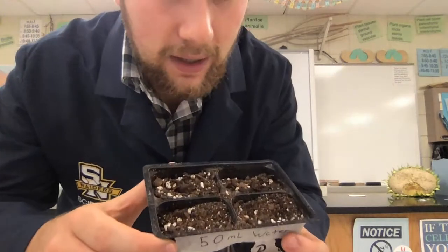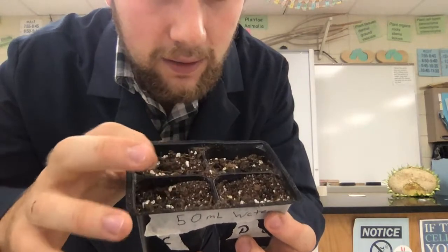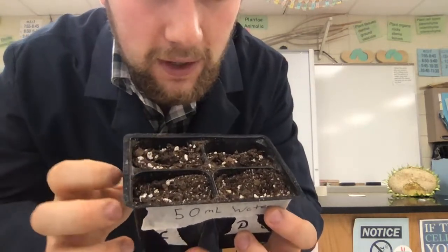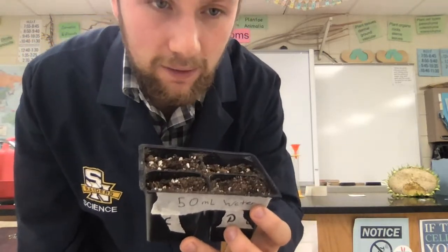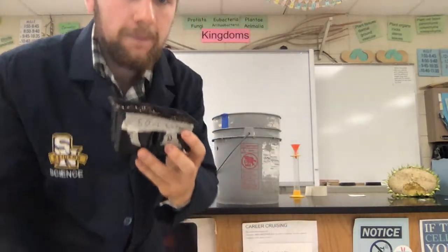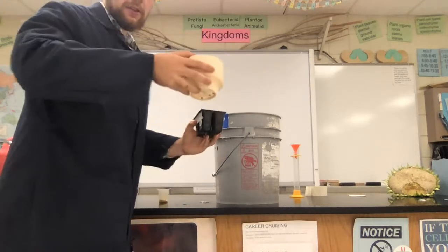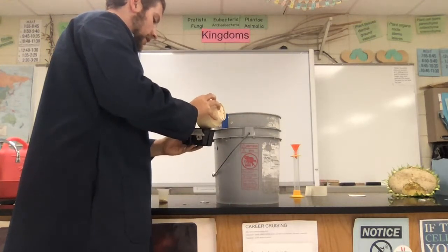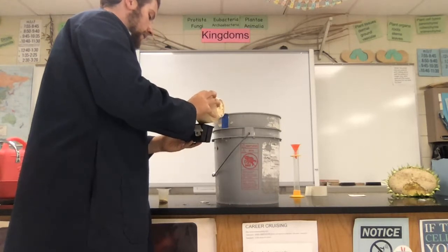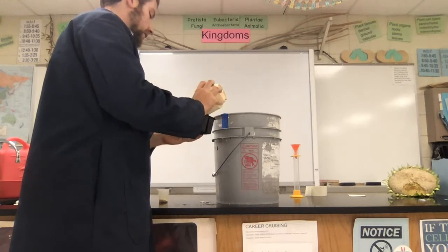So now you can see on the top of our thing, we have seeds in all of our different locations. You might be able to see them, might not, but they're teensy tiny little things. Okay, so now we're gonna cover those seeds up with some dirt. Just give them a good covering. So kind of just take it and sprinkle dirt over them to cover the seeds so that they're not exposed to the air. Germination will be better under kind of moist conditions.